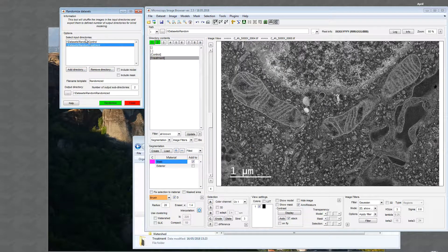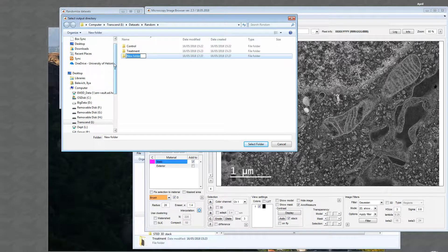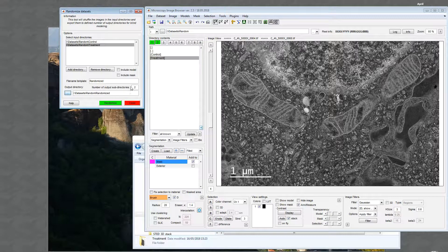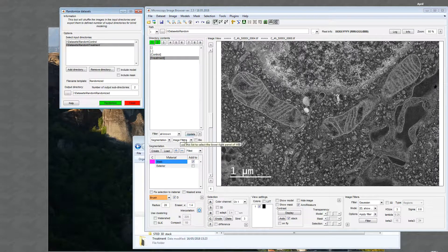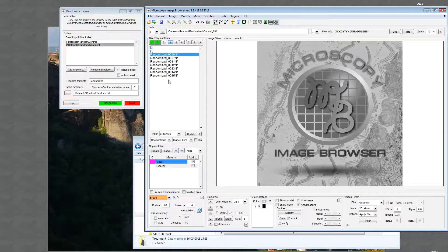Press the Add Directory button and select control and treatment. You can see that the two directories were added to the list of input directories. I can specify the name template for the output and the file name for the results. I'll name it 'randomized.' There is also an option to split the results into a number of subfolders — I'll use two subfolders — and then press Randomize.